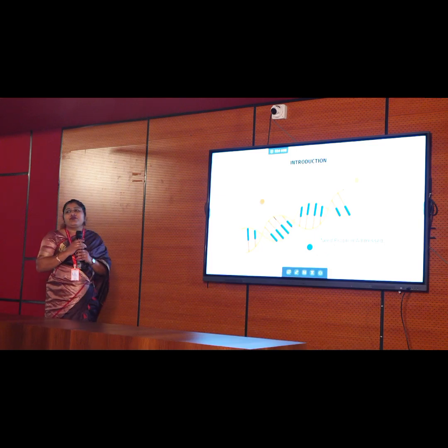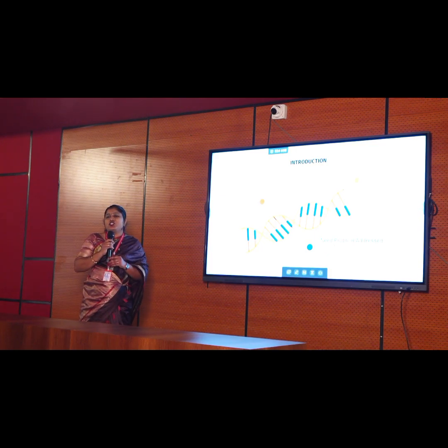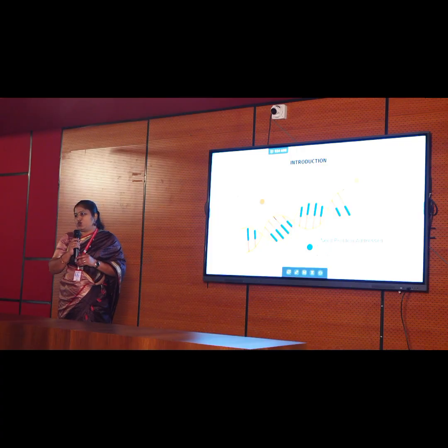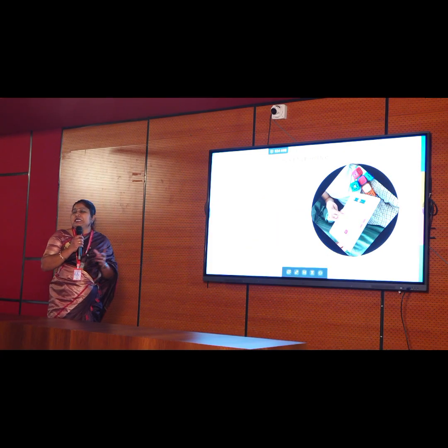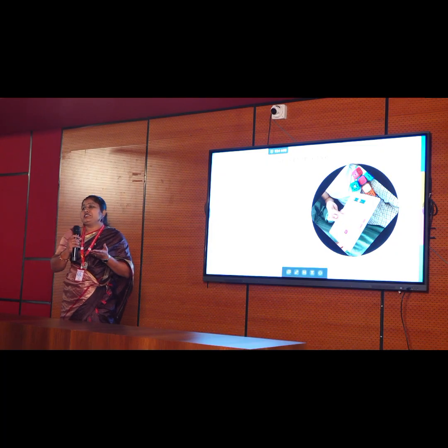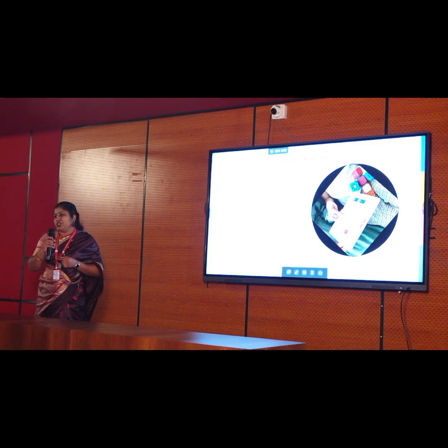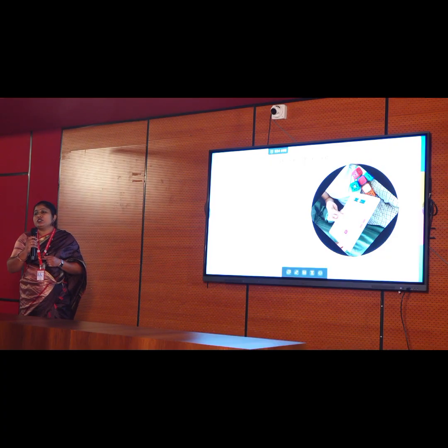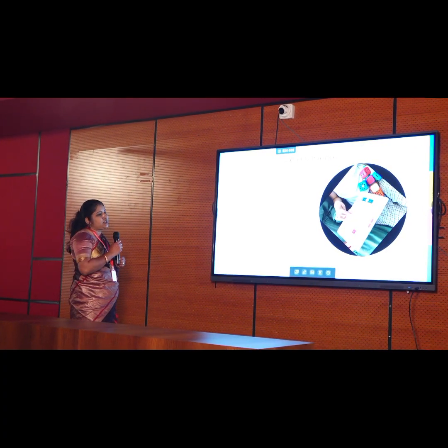So the target group we are focused on is class 10, or grade 10 students. They have actually been involved in this and they have done the benchmark. Next. So what is DNA extraction? What all does it lead to, and in how many different fields? It is connected to medicine, forensic, genetic engineering, which we are going to cover in detail, because genetic engineering and molecular biology are a huge topic. The base for that is DNA. And if you understand how it looks like, then you can carry out further analysis of DNA.